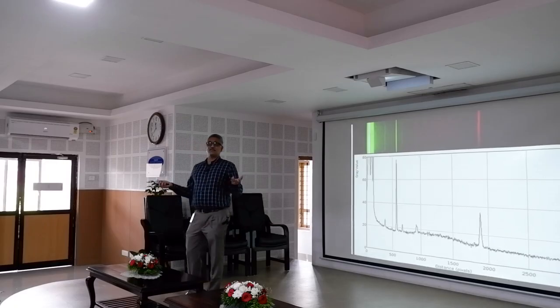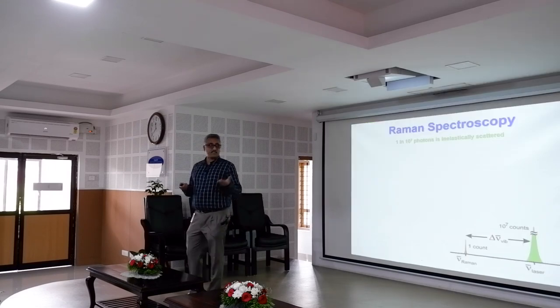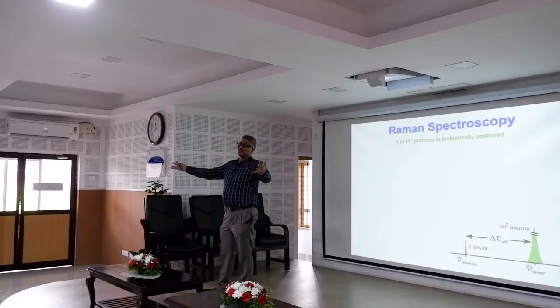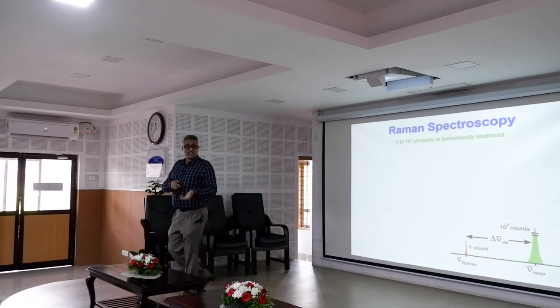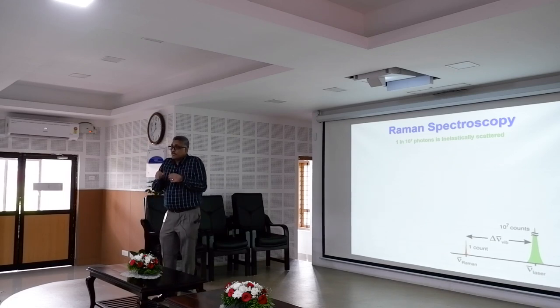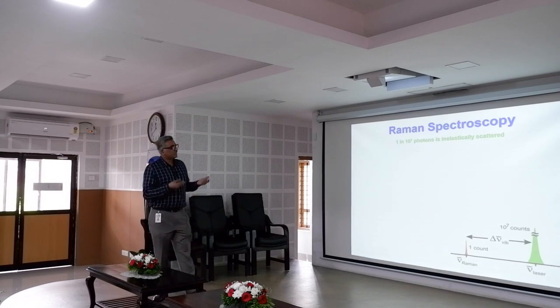So this is what Raman spectroscopy is, and it's so easy to do, and we also can develop this very easily. It doesn't require so much money. But then why do you actually pay so much money for the Raman spectrometer? The reason is how well you can resolve it, how nicely you can get it, how very little signal you can enhance. That's what increases the cost. The peaks I showed were intense, but if I have a very weak peak, I should be able to get it, and that's what the cost goes into. Okay, so that's all there is.